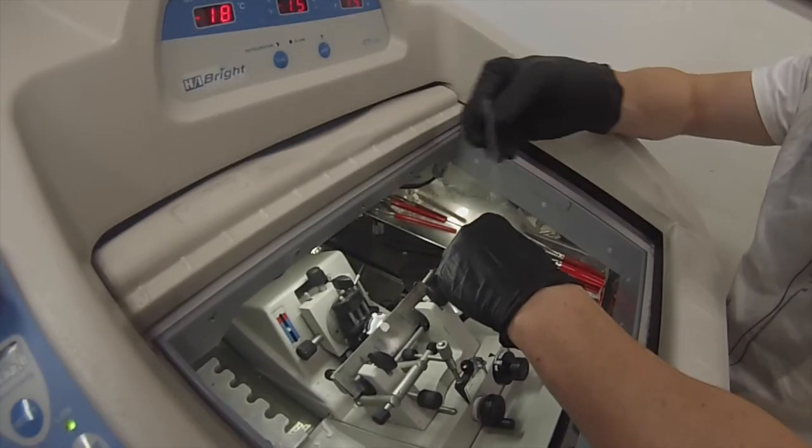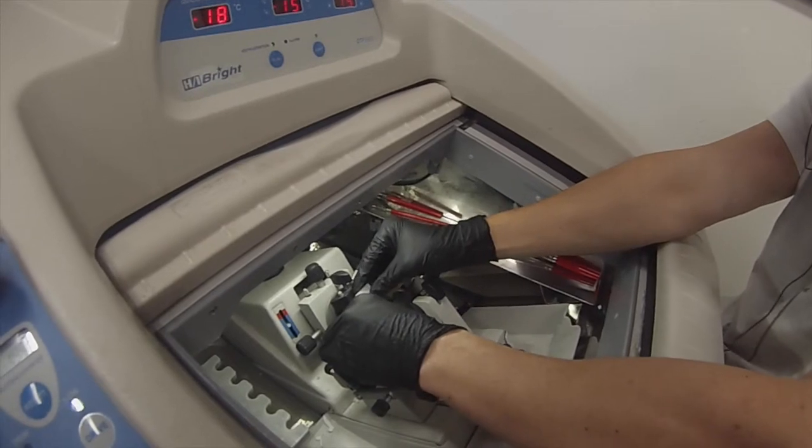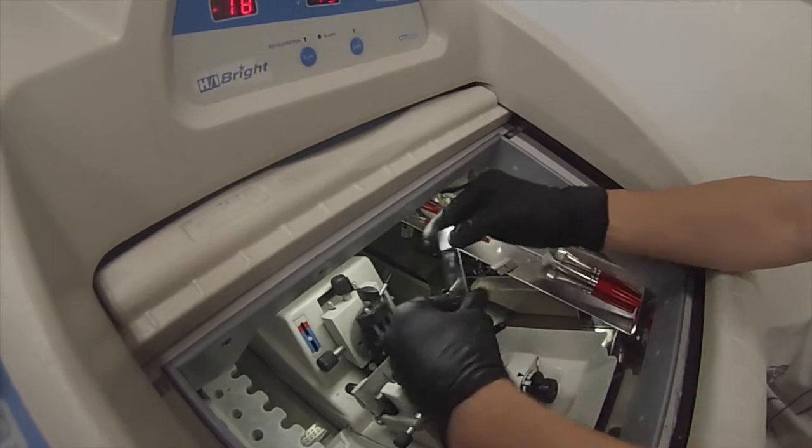Now you're going to take your slide and heat it up with your breath again so it can adhere to the slide. You slowly guide it, connect it to the sample, and it will just come and section onto the slide.